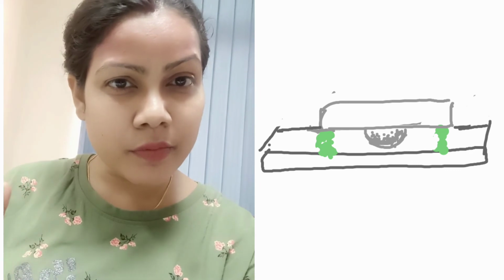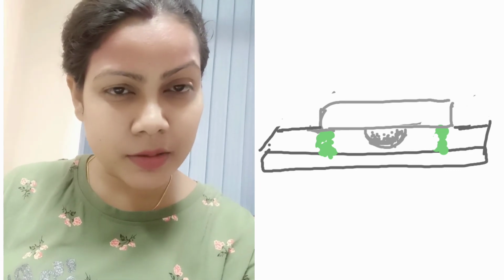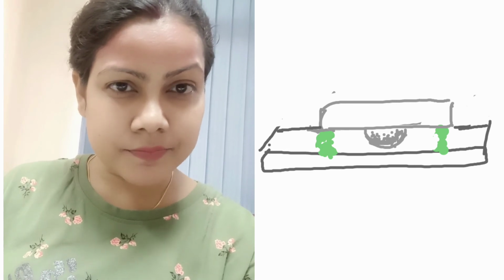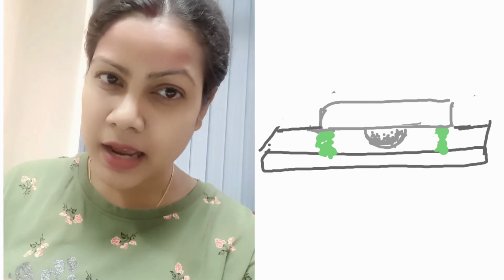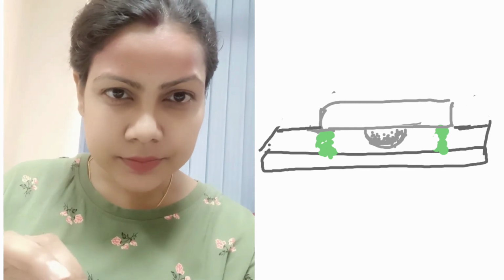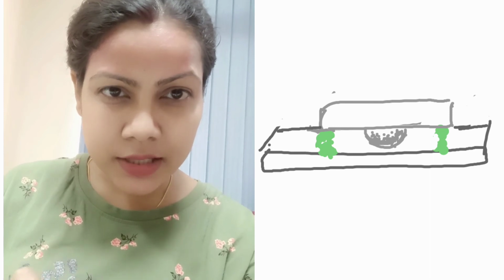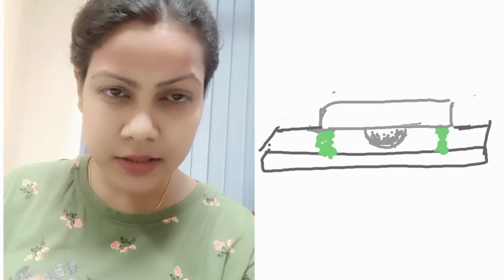We observe this hanging drop under the microscope, at the edge of the drop, where we can find motile bacteria.